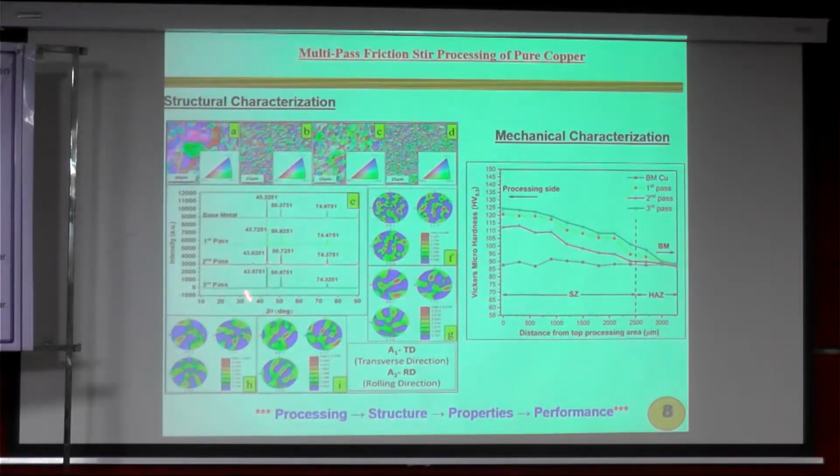Now we have taken the material to the XRD. So XRD again is to study phase identification. We are keen to know whether, by doing the severe plastic deformation, any new phase came or not. To study that, we understood that no new phases evolved, but there is a significant peak shift we have noticed. You can see in the base material, the 100% peak was at 43.32.